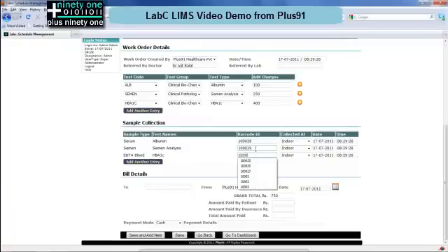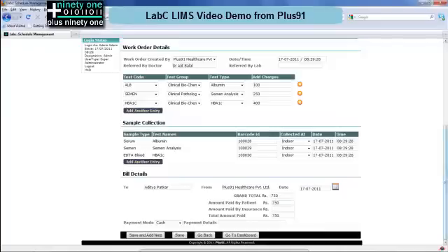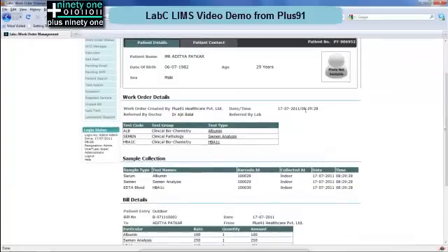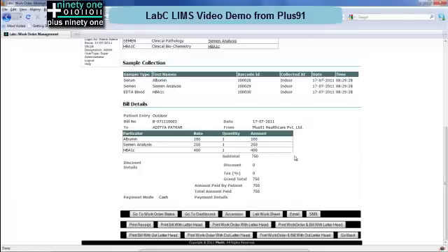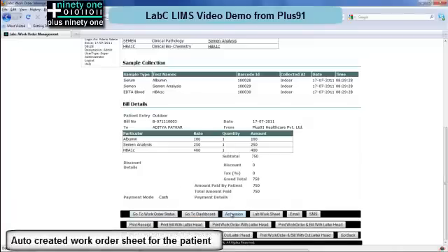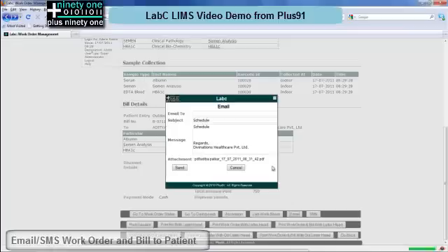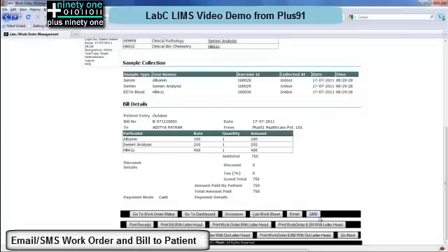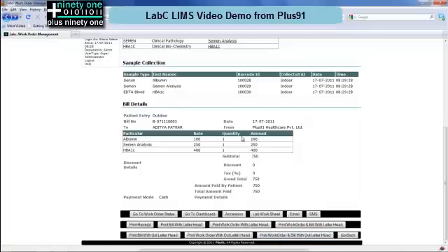Once the sample collection is done, automatically below you see that the total billing has been done. Simply enter the patient name and how much the patient has paid, and click on save. If you click on save and add next, it automatically takes you to the next entry or blank save. This saves time when multiple work orders need to be entered. You can see the entire schedule along with the test samples and the bill. You can print the receipt, the bill, and the entire schedule. You can email the entire schedule, print the lab worksheet, and SMS a reminder to the patient. Hence a whole gamut of options are possible once the work order entry is done.